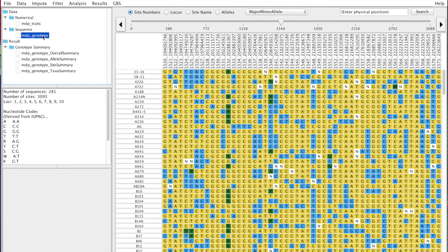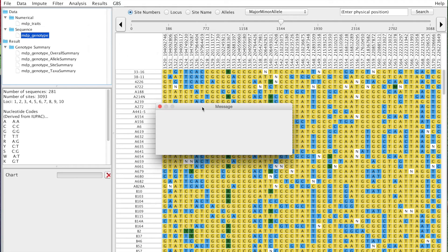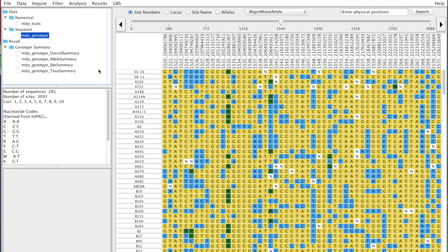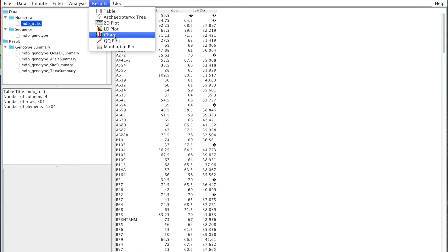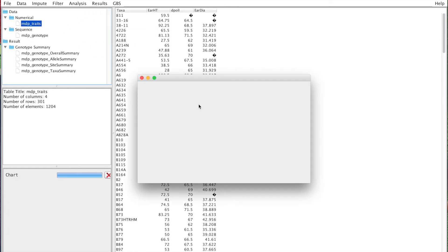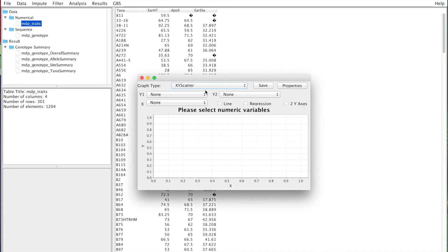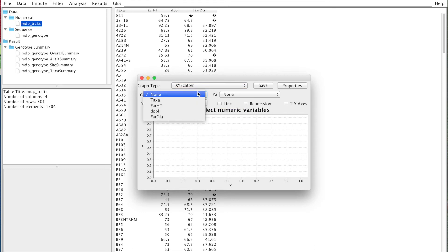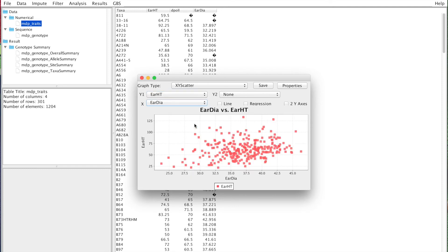Finally, regarding phenotypes, you can also do some things. Again, Results, Chart. We can do an XY scatter. Maybe you have phenotypes that are correlated and you want to see that correlation. In this case, I'm going to plot ear height by ear diameter.